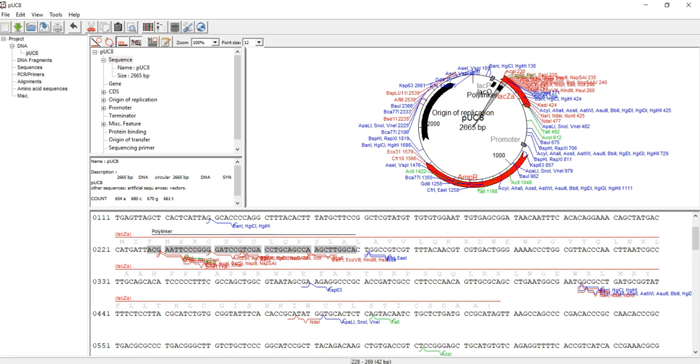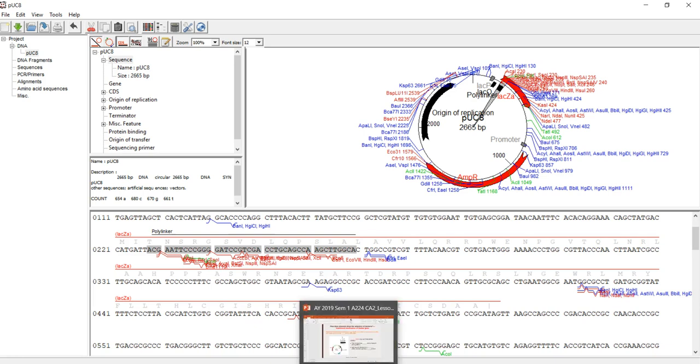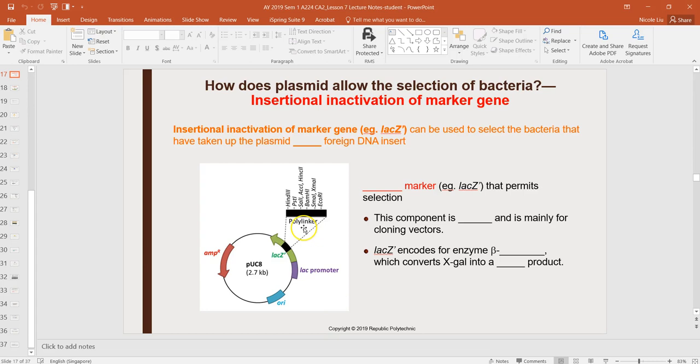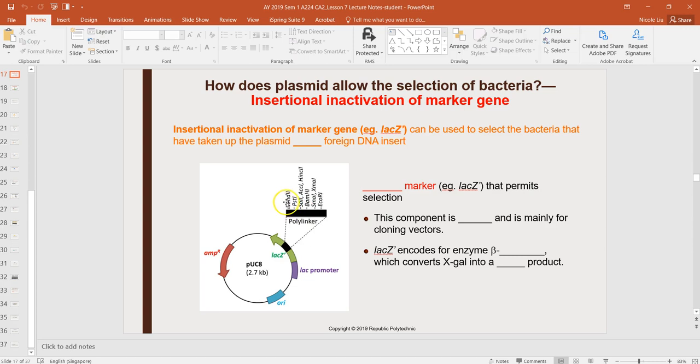First, let's go to the pUC map. You'll see these are the restriction sites. Let's choose most of them—let's say HindIII, PstI—and I'm going to come back to this slide.